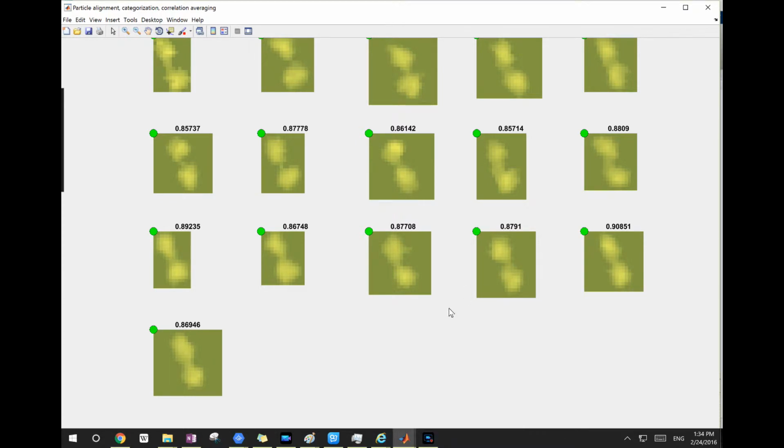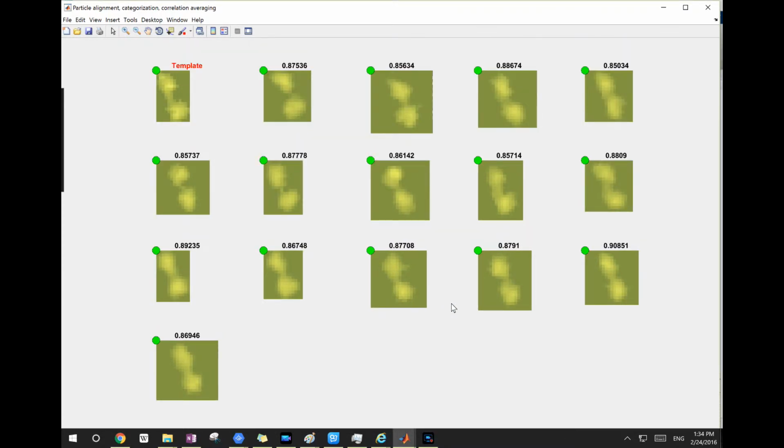Yeah, the system is a little slow in the processing because I use the screen recorder, but usually it's pretty fast. Not like that. Just bear in mind. So right now, I think they are good.